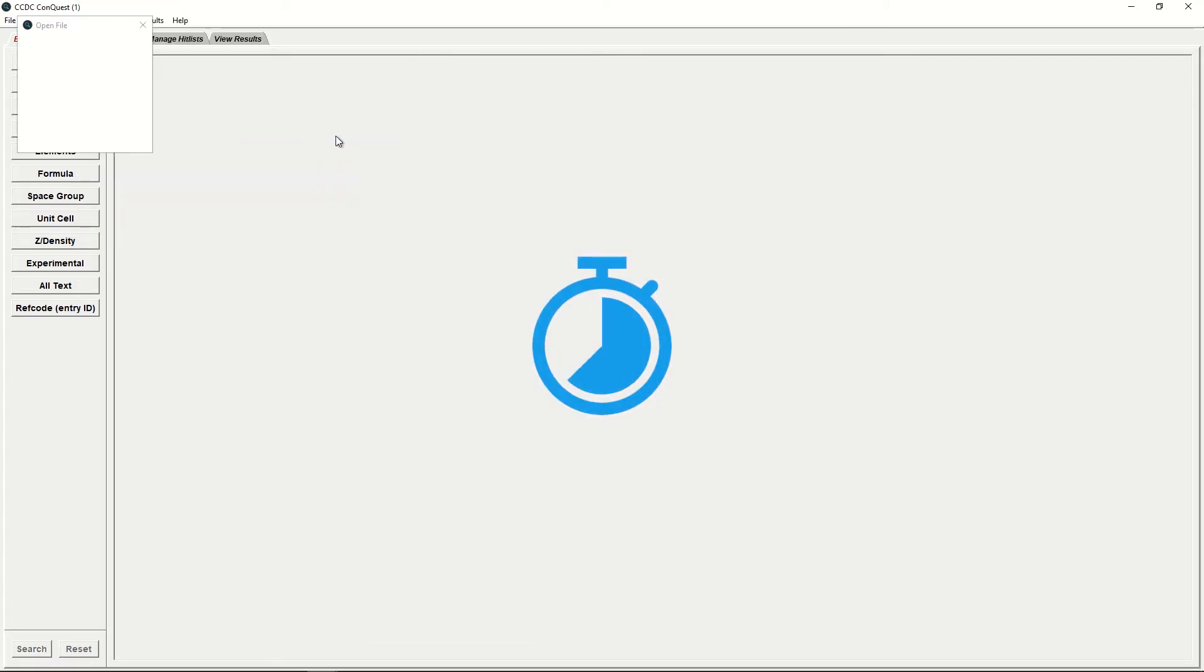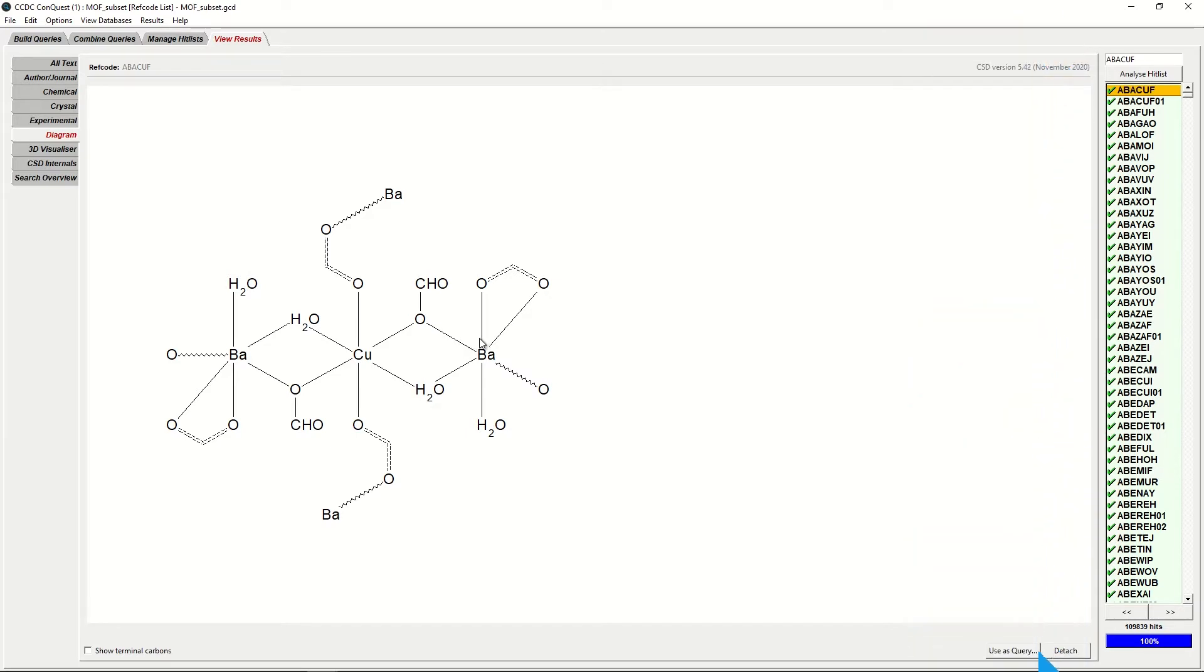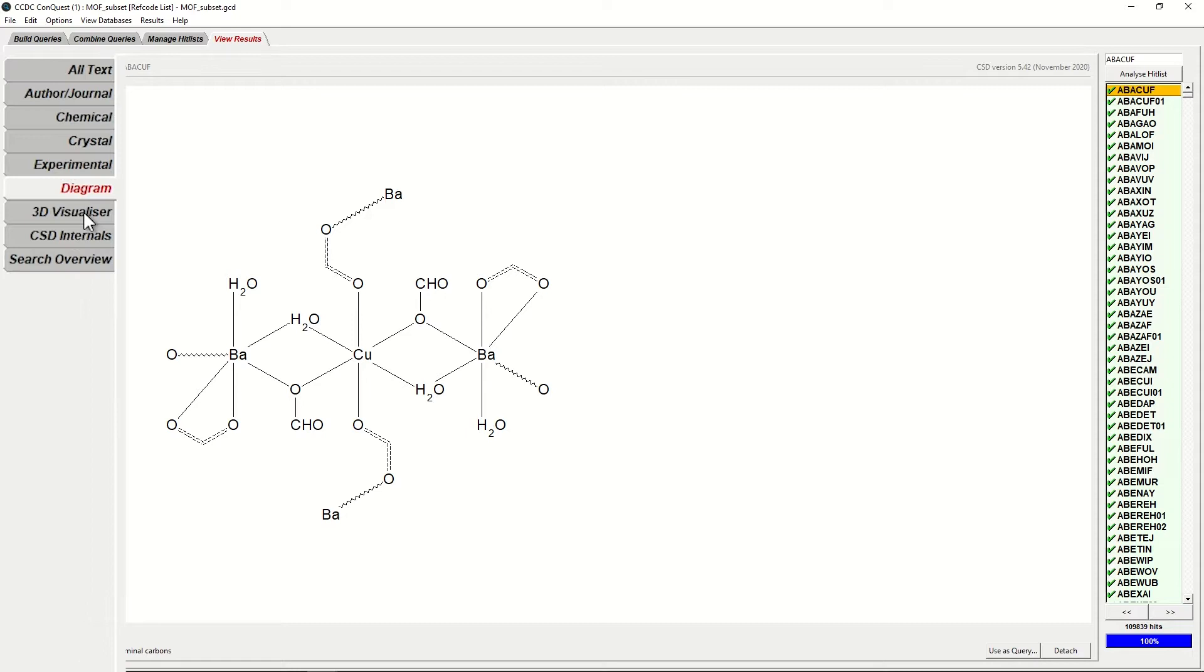However, when it does, it will give you a hit list of all the Metal Organic Frameworks within the CSD. This list can be seen on the right-hand side of the screen here, and should you wish to visualize them as a 3D visualizer, you can click on the tab on the left-hand side here.